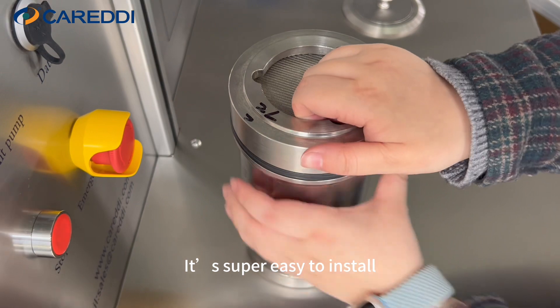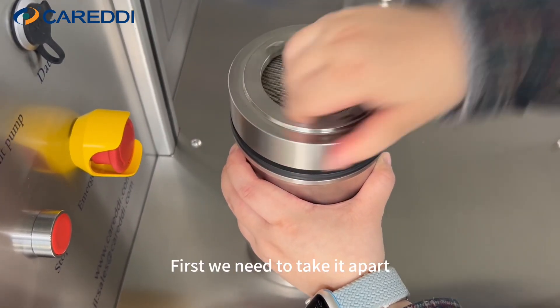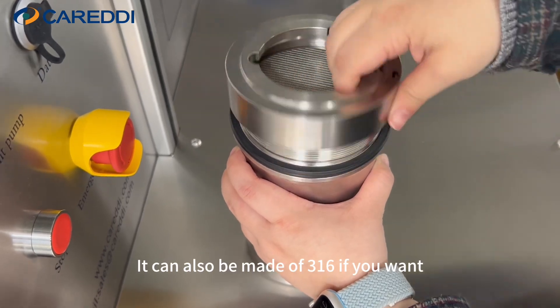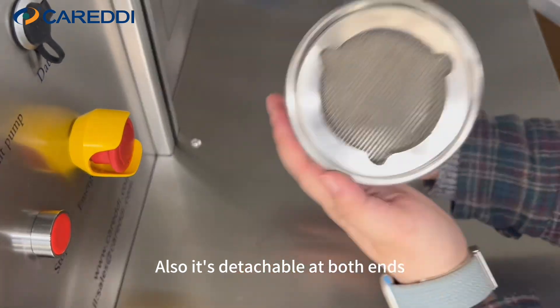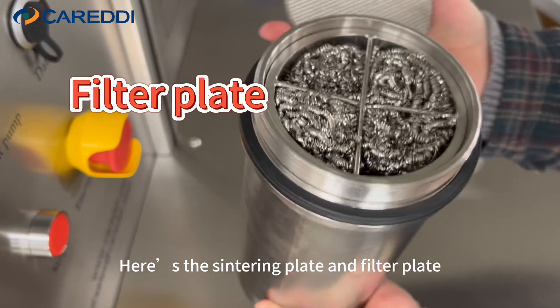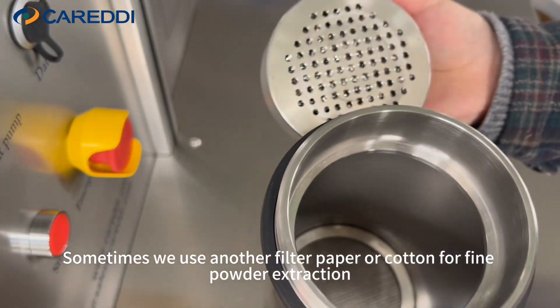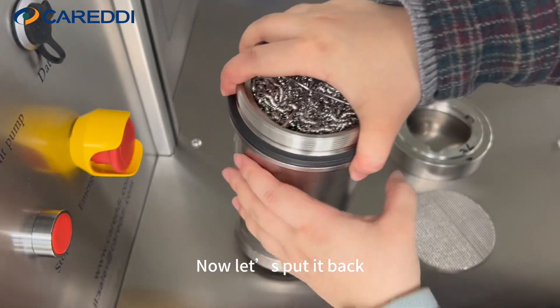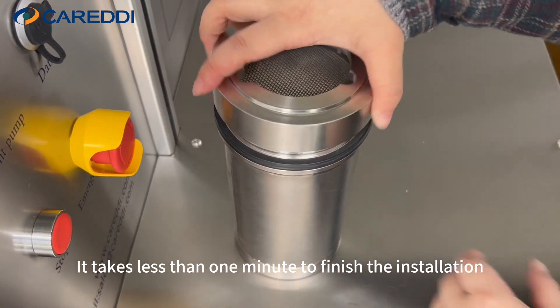It's super easy to install — let me show it to you. First, we need to take care of the part. It can also be made of 316 stainless steel if you want. It's detachable at both ends. Here's the centering plate and filter plate. Sometimes we use another filter paper or cotton for fine powder extraction. Now let's put it back — it takes less than one minute to finish the whole process.